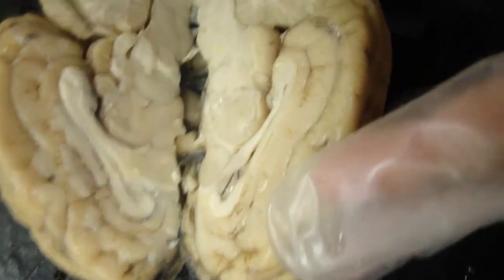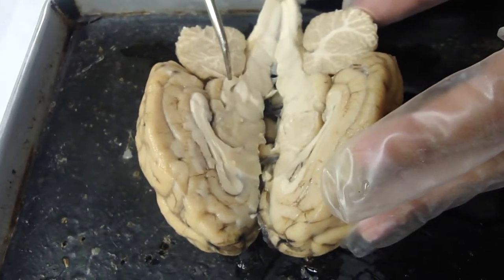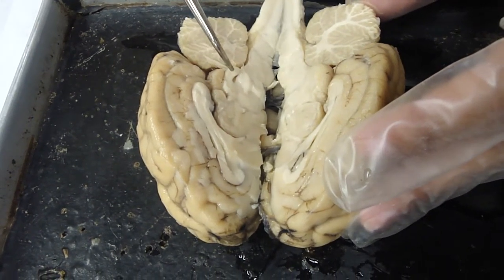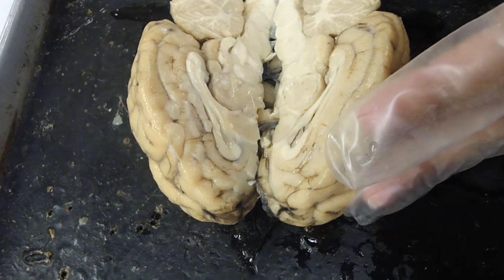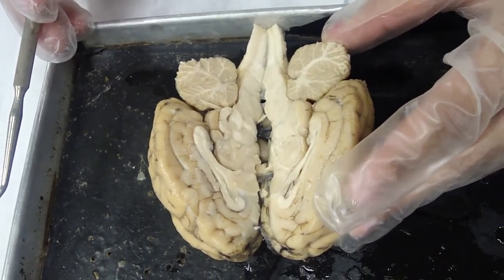If you saw it a lot in making your sagittal section, you'll probably lose it. But if you have a good straight section, you can probably locate it. Pointing at it, as the point comes down, you find it right down there at the tip of the point. That's the anterior commissure. There's also a posterior commissure.